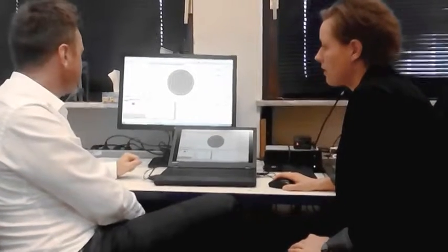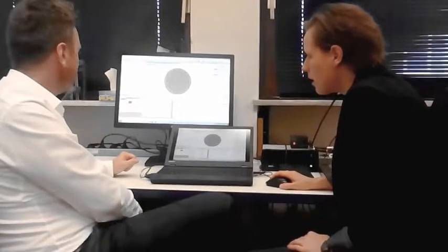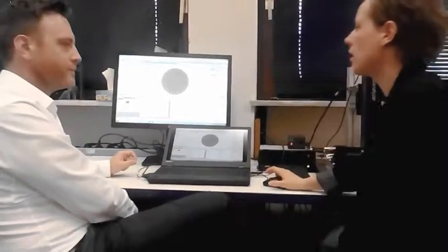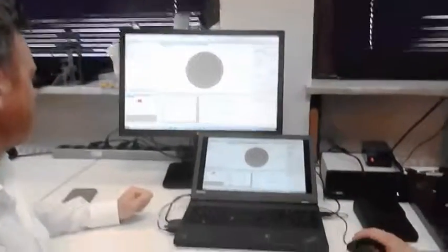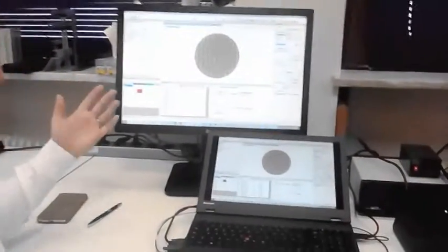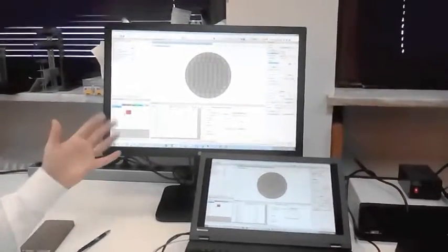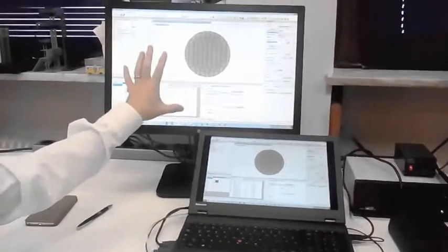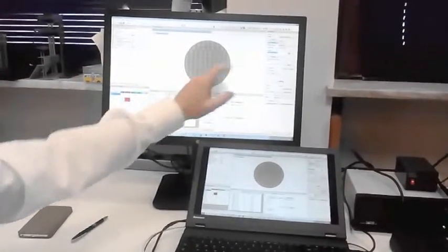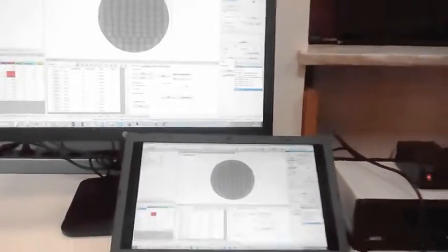It's the sum in total, not only the metals or fibers or whatever. In total it is allowed only to have 250, and we have more than 900. So it's a very quick way of seeing that you have a failure instantly. It does all of the analysis by itself, completely independently, based on these embedded reports. VDA BD19, as I mentioned, is standard. It's already fitted in here, so all you have to do is select it as an option directly. You can change this at any time, before the measurement or after the measurement, it doesn't matter.